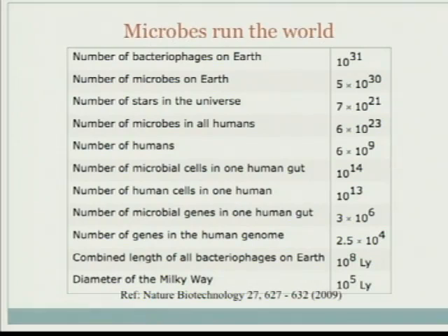That makes it possible, but it also makes sense because those microbial organisms really do work together as a whole community. So if you analyze them individually, you don't get any insights into the interactions between those microbial organisms. So one side is that it makes it possible to analyze the genomic DNA sequence from those bacteria, and the other side is that you can analyze them all together as a whole.